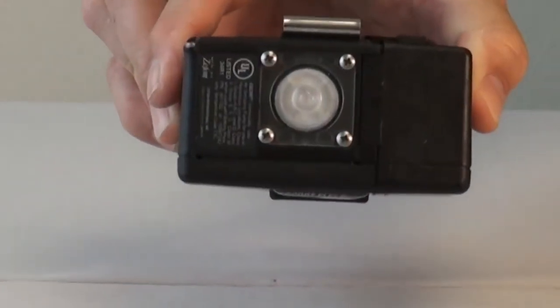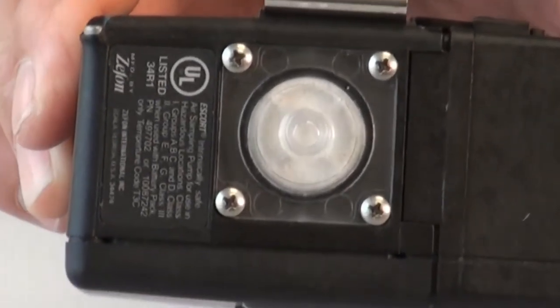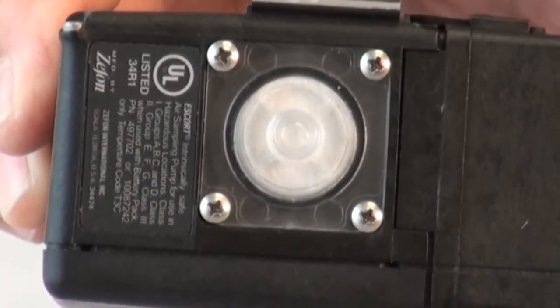Before you begin calibration, check the pump inlet filter for dust. If the filter is heavily loaded, it needs to be replaced.